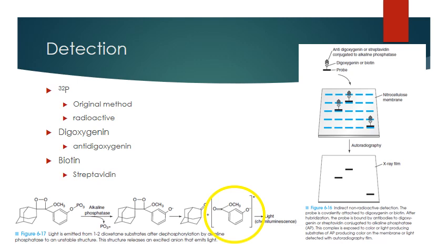So you allow the phosphate 32 labeled probe to interact with your nitrocellulose membrane. Allow that to happen for a specified amount of time, then wash off the unbound probe. And in the case of phosphate 32, you could use a light sensitive film to detect the hybridized and tagged probes. Okay. However, as I've said time and time again, radioactive probes are not attractive anymore in the laboratory because we don't like to have to dispose of them. Of course, there's a risk to your staff as well, but they're very expensive to get rid of.